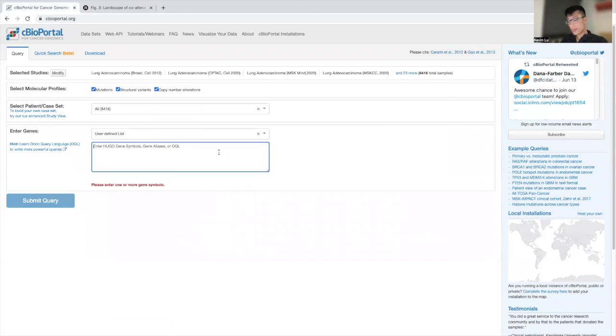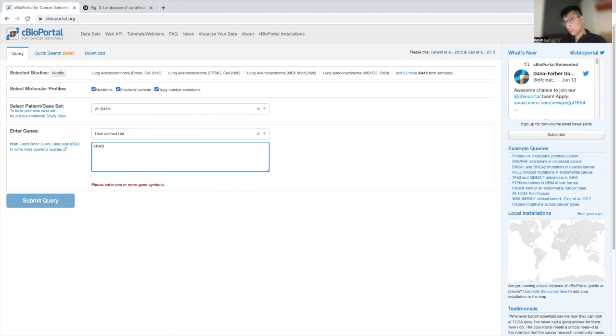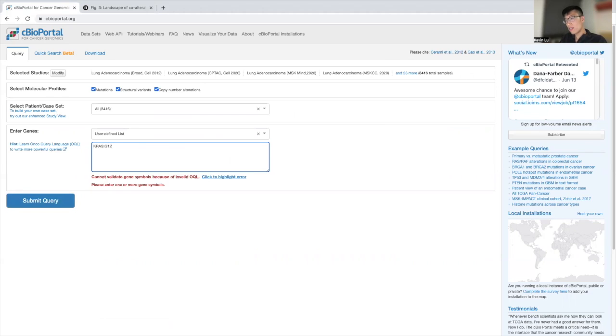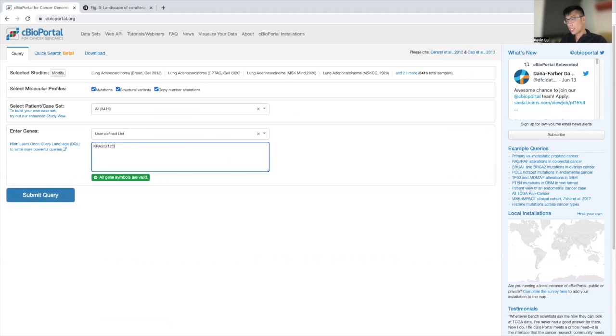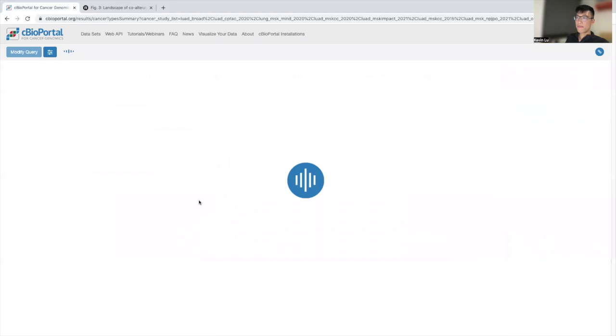So we want to take a look at the co-alterations representing KRAS-G12C. We're going to filter by KRAS-G12C. Let's submit.